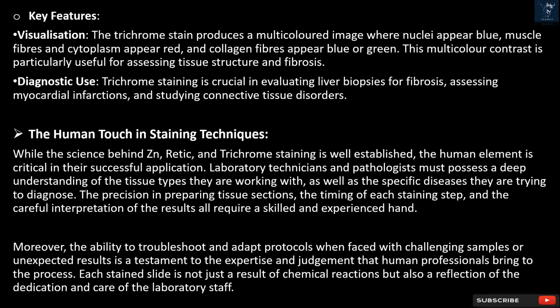The precision in preparing tissue sections, the timing of each staining step, and the careful interpretation of the results all require a skilled and experienced hand. Moreover, the ability to troubleshoot and adapt protocols when faced with challenging samples or unexpected results is a testament to the expertise and judgment that human professionals bring to the process.